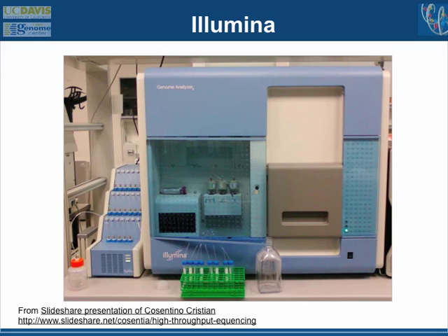So when you go through multiple amplification steps, you run even more risks of contamination. So there are some issues with it, but it's much more of a problem that it just fails. And Rob Knight, who works on microbial sequencing, has a great slide where he says 454 is the temperature at which your money burns.